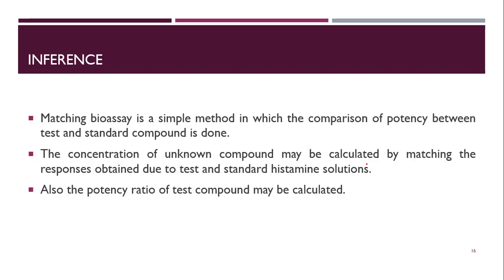Okay, so inference. Matching bioassay is a simple method in which comparison of potency between test and standard compound is done. The concentration of unknown compound may be calculated by matching the responses obtained due to test and standard histamine solution.